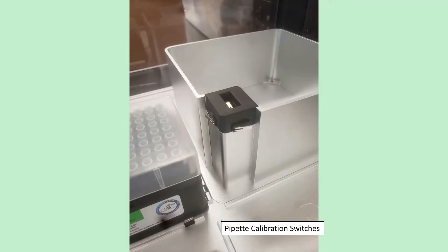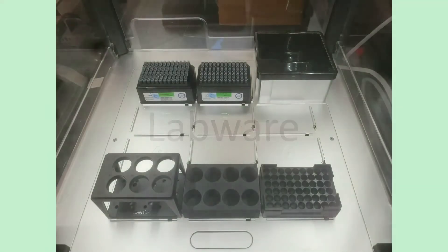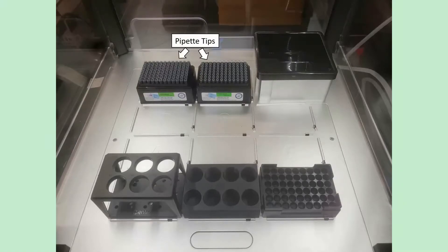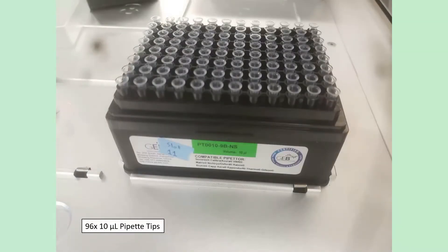That's the built-in stuff. What you have next is called labware — everything that goes in these 11 slots, which are standard sizing for biology equipment like well plates. In slot 10 you get 96 300-microliter pipette tips for the 30 to 300 microliter pipette, and in slot 11 there are another 96 10-microliter pipette tips for the 1 to 10 microliter pipette.